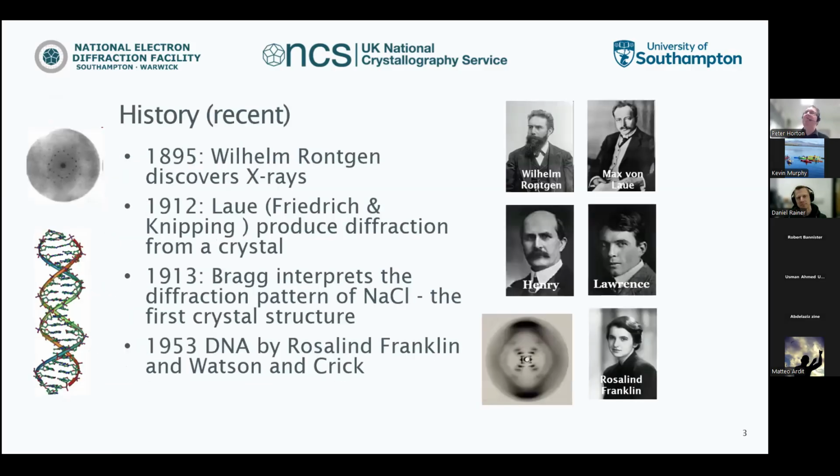So, a very brief history. X-rays were discovered around 1895, so just over 130 years ago, and it was only just over 100 years ago that it was found that you can have diffraction in a crystal, and that you can determine crystal structures from these diffraction patterns. And one of the more famous things is around 1950, Rosalind Franklin, Watson and Crick discovering the overall structure of DNA, the double helix, and so on.